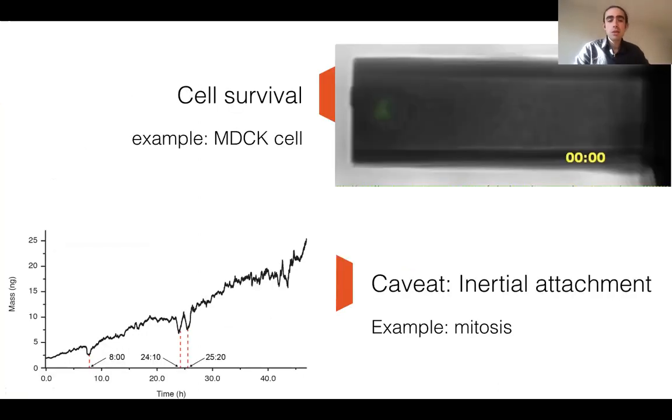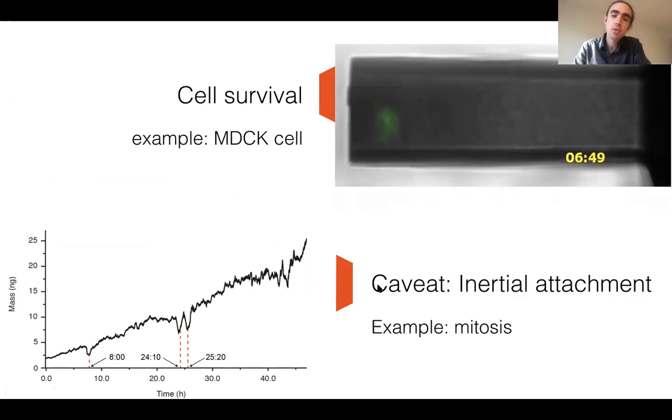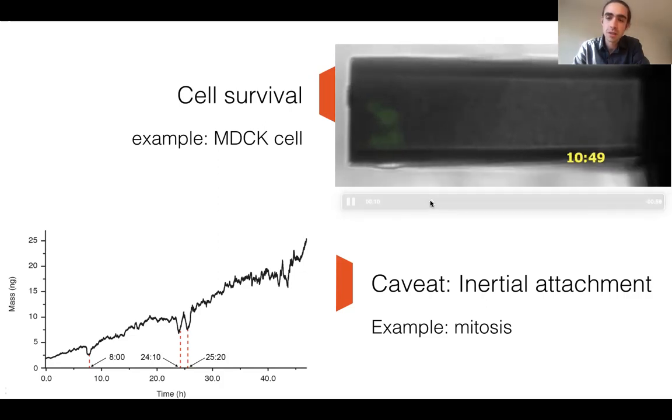Now, what we see here as well is a different example, not the HeLa cells, but the MDCK cells. And here the green is a different thing. This is just the histones being tagged. And the reason for that histone tag is to see better when mitosis is happening. So here you have just seen it, the cell rounds up, and here you see the metaphase plate of it. And then the chromosomes make two parties, so to say, for the cytokinesis, they split such that you have two cells later on that can spread. And this is just how the proliferation of these cells works.